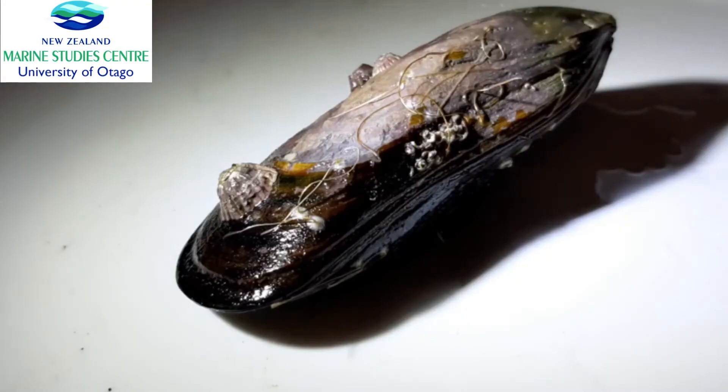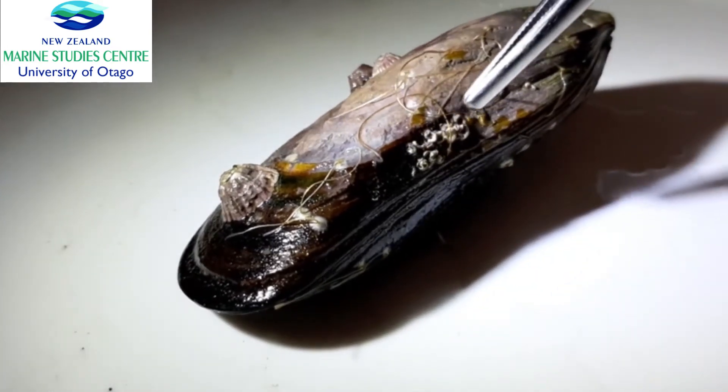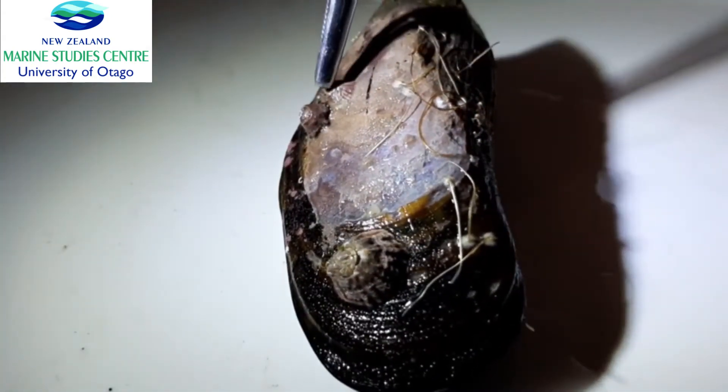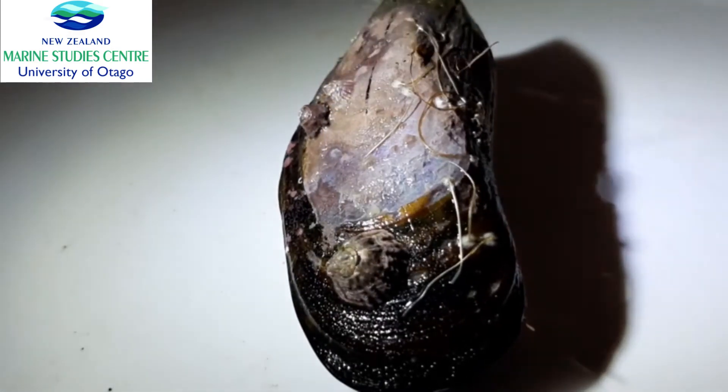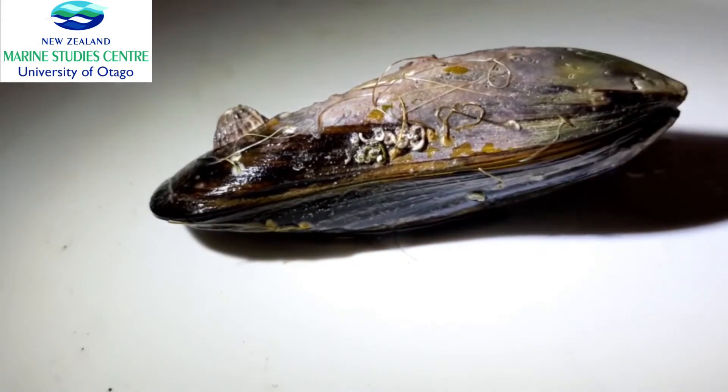The shell itself is not only protection for the mussel, but it's also home for other types of animals. You can see right here that we have some tube worms growing and also barnacles — many of them — that have attached to this mussel. So the shells serve a purpose in protecting the soft parts inside the mussel, but they also create a micro-habitat, forming homes and places to grow for other animals.